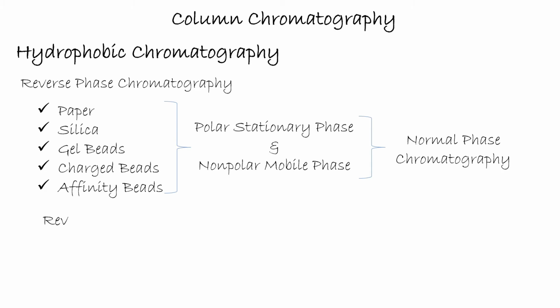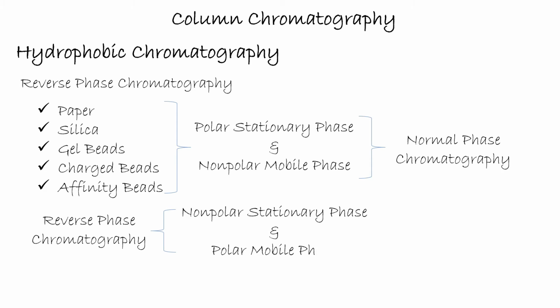But in case of reverse phase, the stationary phase is non-polar and the mobile phase is relatively polar, so this technique is known as reverse phase chromatography. In this technique, we have beads functionalized with aliphatic chains.